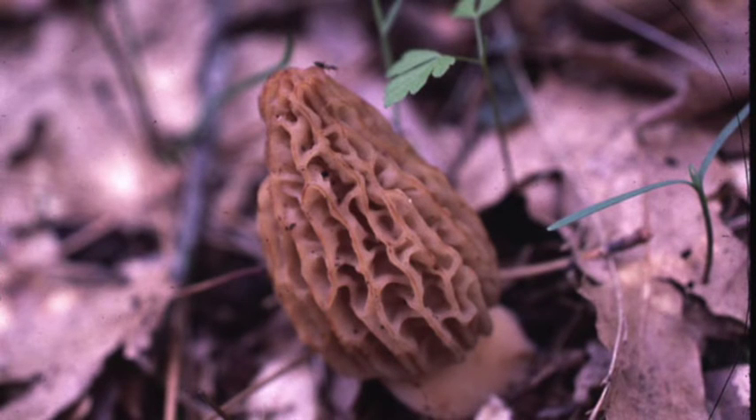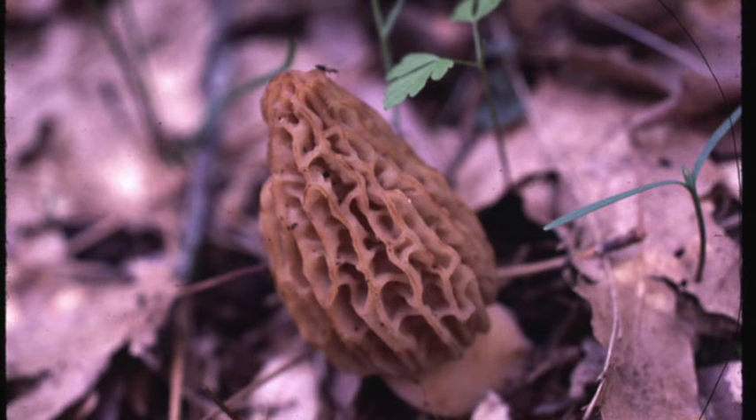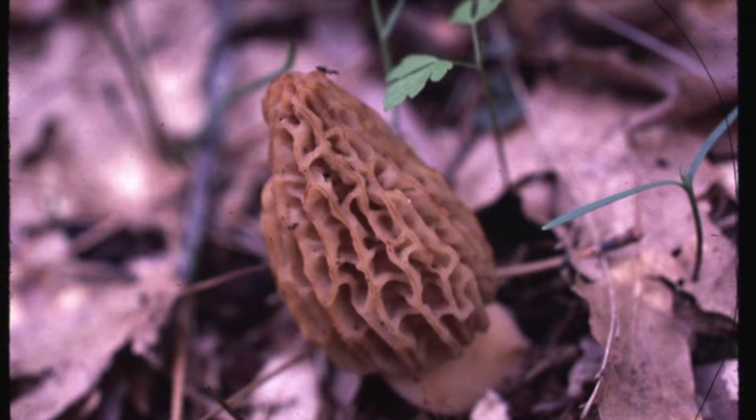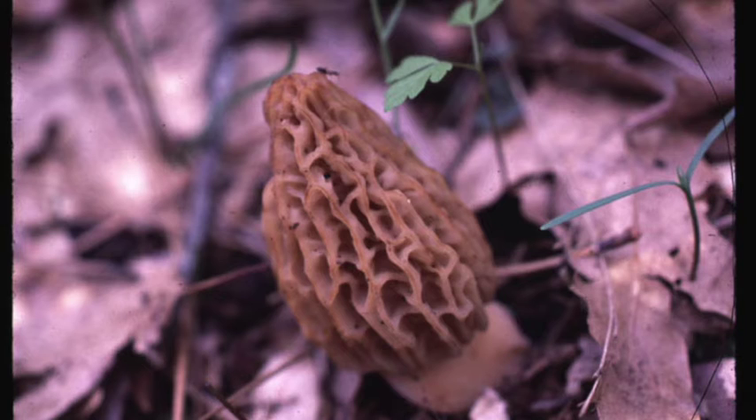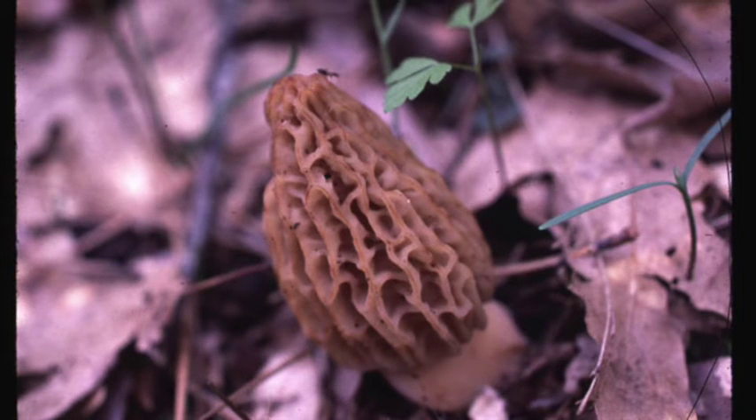The prepared slide we have in class is a cross-section through the cap of this morel. That cross-section will have little cup-like structures and you'll be able to see the reproductive spores inside the morel.